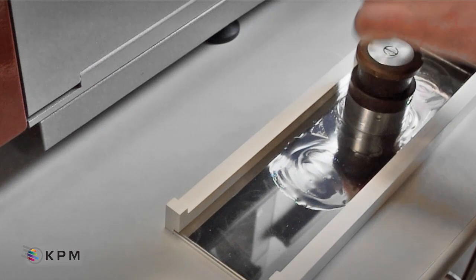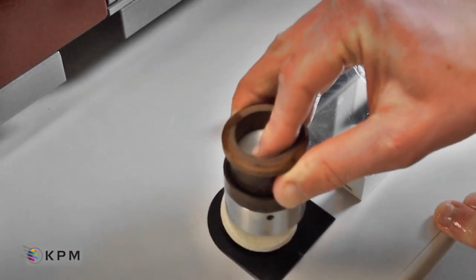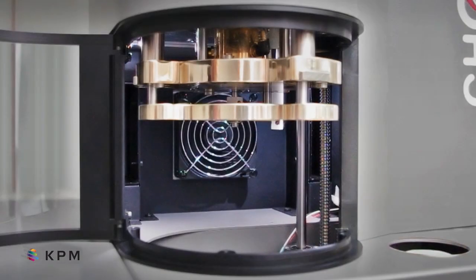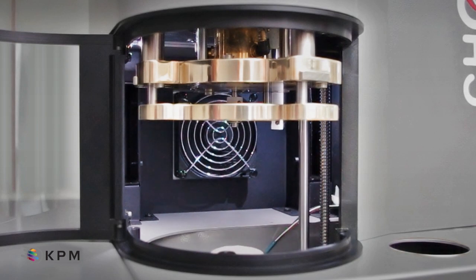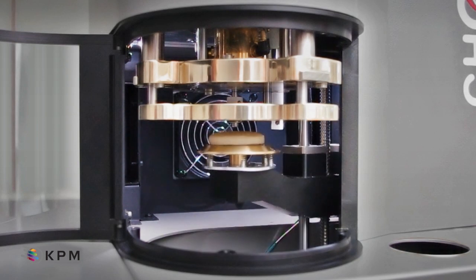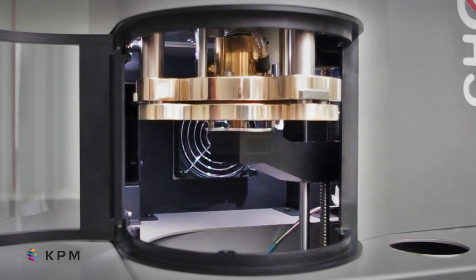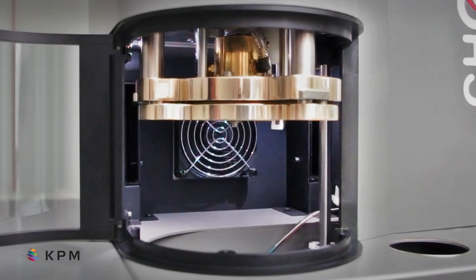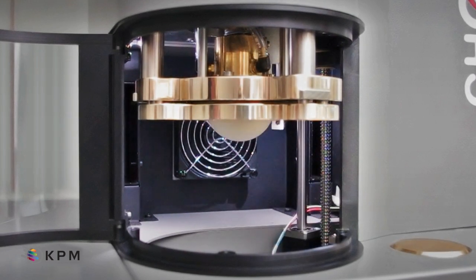Automatic positioning and swelling of dough pieces in a humidity and temperature controlled compartment, the inverted bubble, which is more spherical and closer to the ideal test conditions.